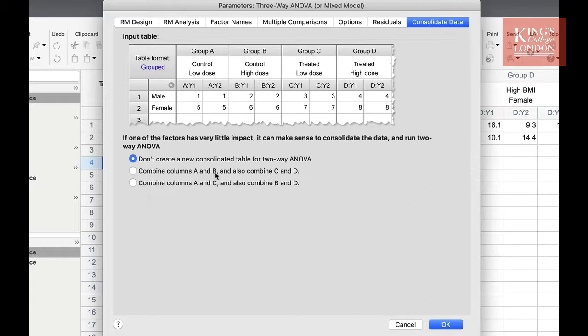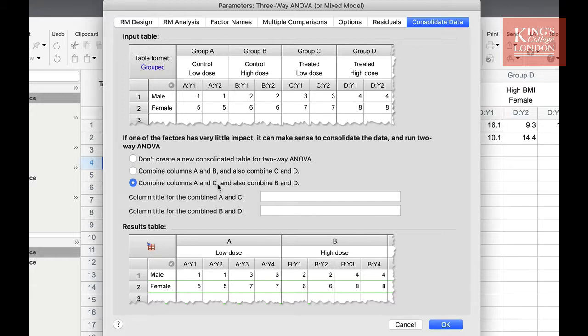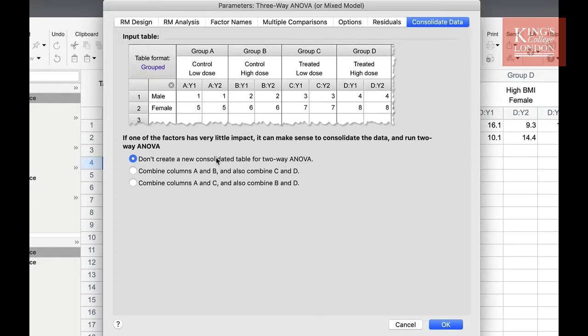In my case, low BMI versus high BMI, or I may want to look at the males versus female data. On this occasion, I'm not going to do this, but it's a useful option to have. Once you are happy with the options you have chosen, simply click on OK to view your results.